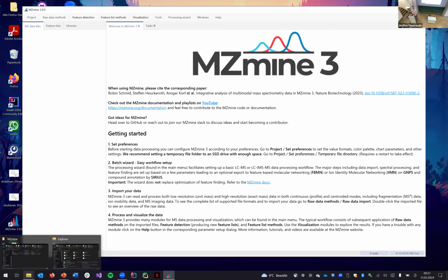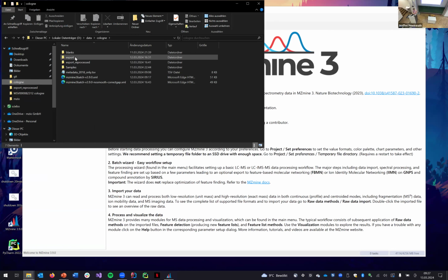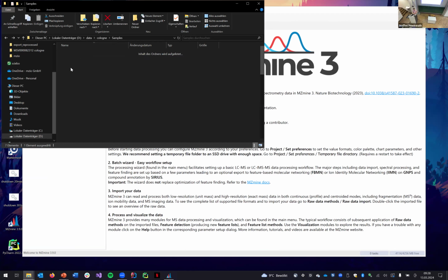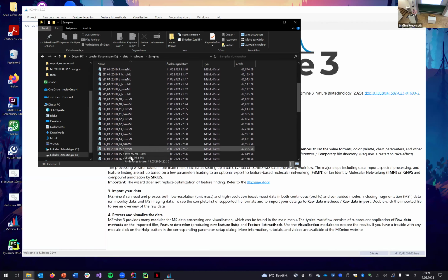Okay, so if you have MZmine open, then first of all, we can look at our data. I'm just going to pull up the data set. Oops, not this one. So I will start in the samples folder. You can pick any file you want, but I will pick this specific one here, the 19_A, because it's something I can show you some things on.